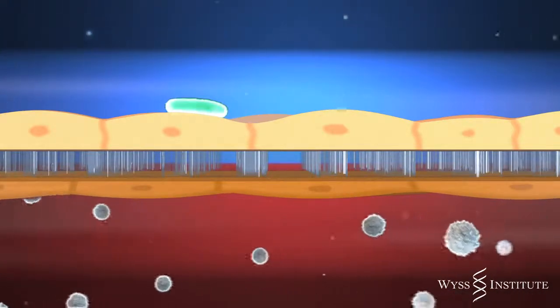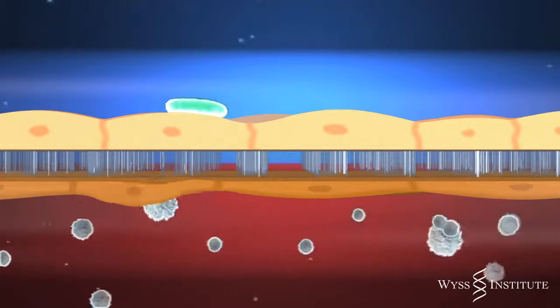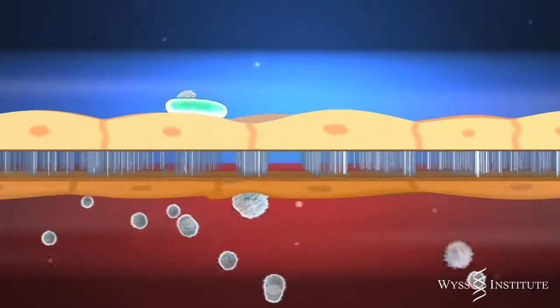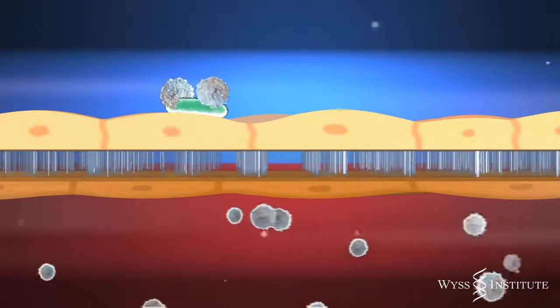We then saw the white blood cells migrate across the capillary cell layer, through the pores of the central membrane, and into the air space where they engulfed the bacteria.